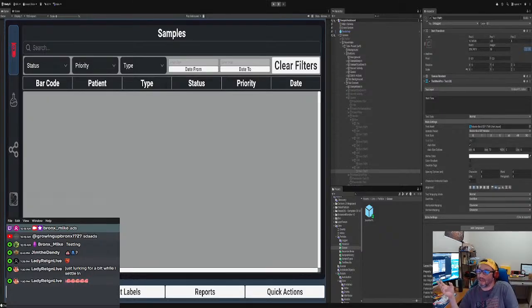Now, is there anything else anybody wants to see in the sample scene? Does anybody in the audience use LIMS, have to use it at work? Is there something you want to see on just the sample scene? Okay, I'm just throwing that out there. See if you guys could figure it out. What you guys want is what you guys want. All right. Is the UI okay? So basically, what you got to do is make sure that the actions are no more than 2 or 3 clicks away, and I believe we did that. Let me see.